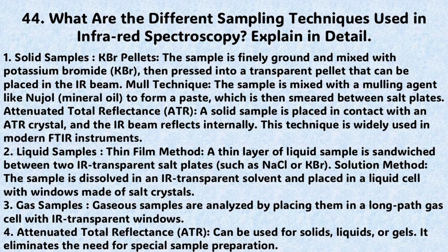Gas samples: gaseous samples are analyzed by placing them in a long path gas cell with infrared transparent windows. Attenuated total reflectance, ATR, can be used for solids, liquids, or gels. It eliminates the need for special sample preparation.